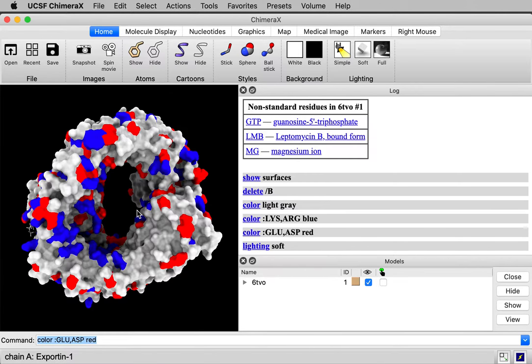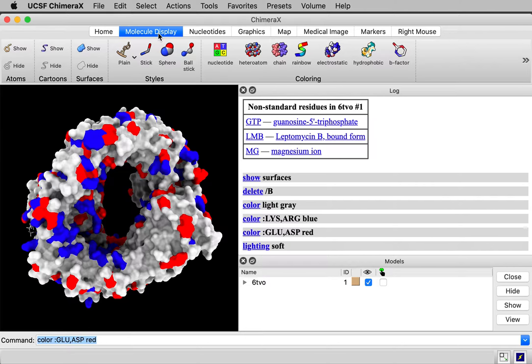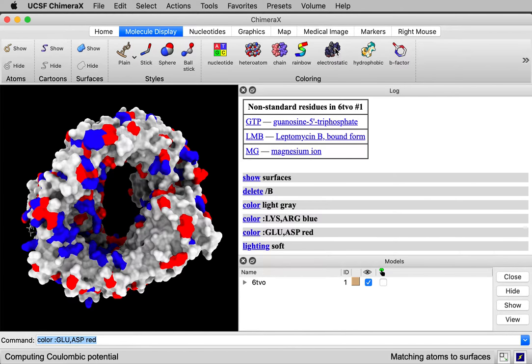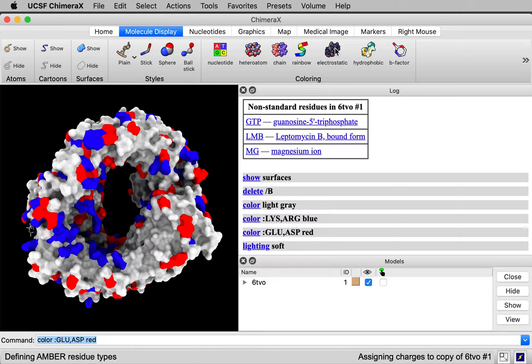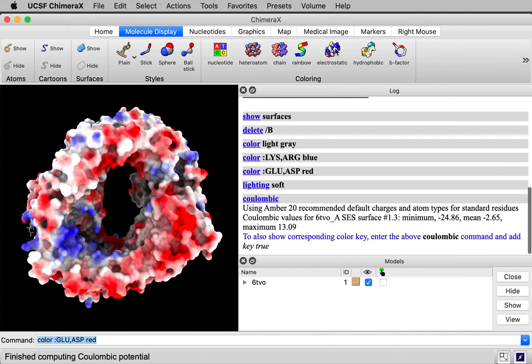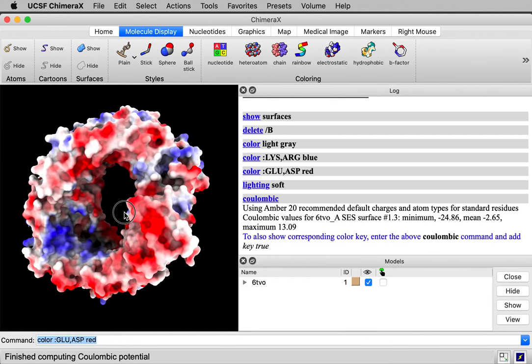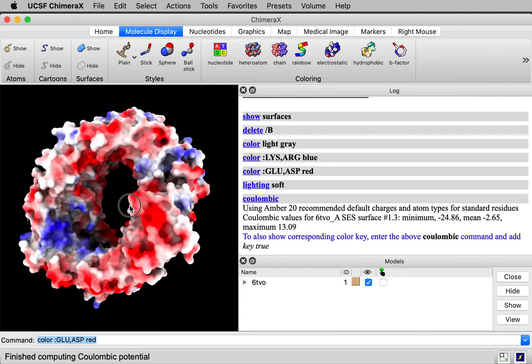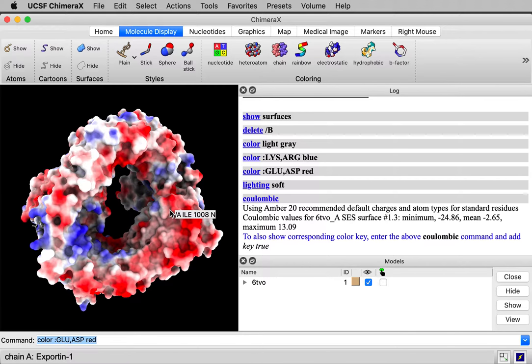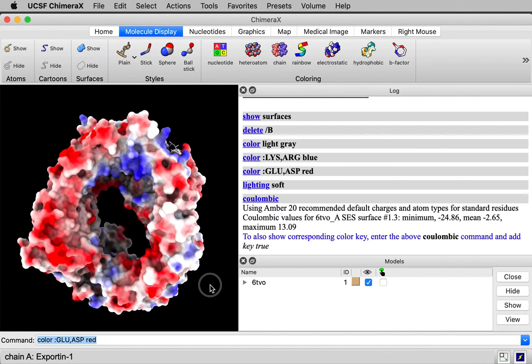The second way now to do the coloring that really does electrostatic potential can be done in ChimeraX. I go to the molecule display toolbar and under coloring it says electrostatic. This computes charges for all of the residues. The charges are distributed on different atoms of the different residues. It's using Amber default charges and it uses a 1 over R type of potential. It also has a distance dependent dielectric to try to account a little bit for the polarizability of the protein and the solvent.